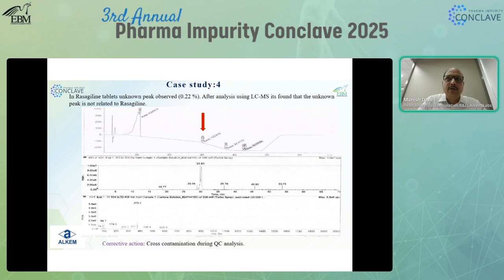The flask was not completely cleaned as per the procedure, and that flask had been used during RS analysis, so this cross contamination happened. We confirmed that it was a different product, and the cross contamination was affecting this particular batch analysis. According to the complete investigation, the report was submitted to quality control, and accordingly they made the CAPA on issuing glassware to the scientists. So based on this information, this hypothesis and the complete investigation from mass spectroscopy, an appropriate CAPA has been established.